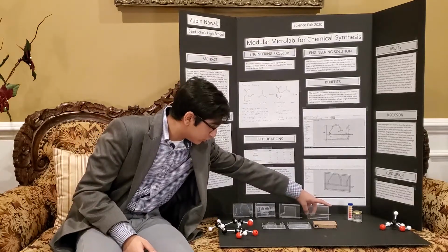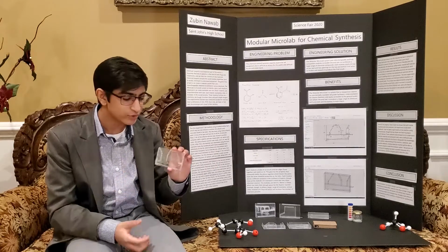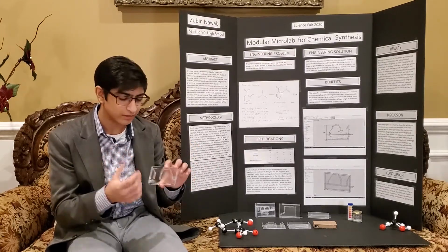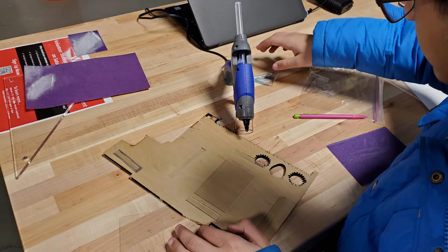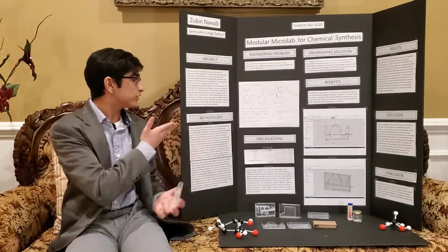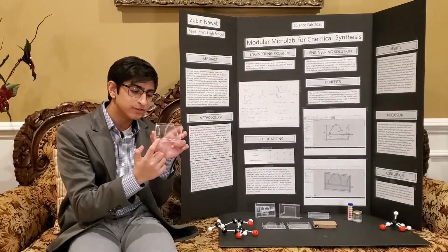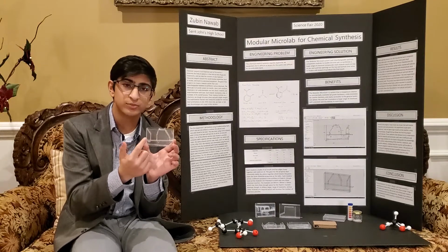So yeah, I'm going to focus on this module over here, the intake module, because it really shows the different steps I had to take to finalize this design. This one was one of the hardest to design because it had to do specifically with volumetric measurements, as you can see here. Those stoichiometry measurements allowed me to figure out exactly what volume I need to make these two compartments. The salicylic acid should be here, and the acetic acid should be here.